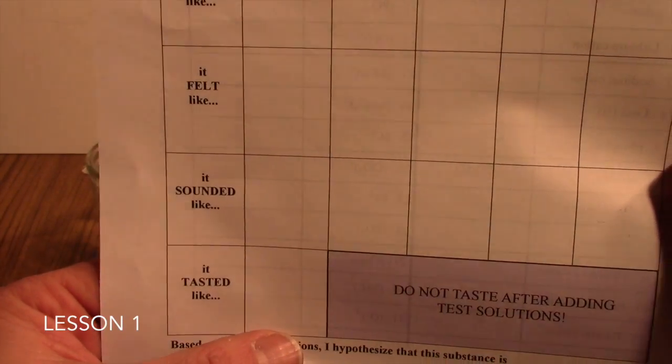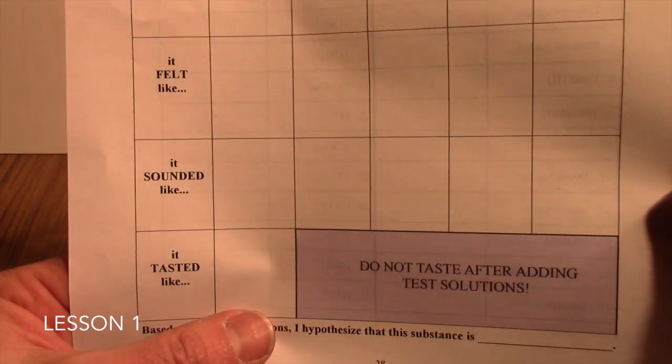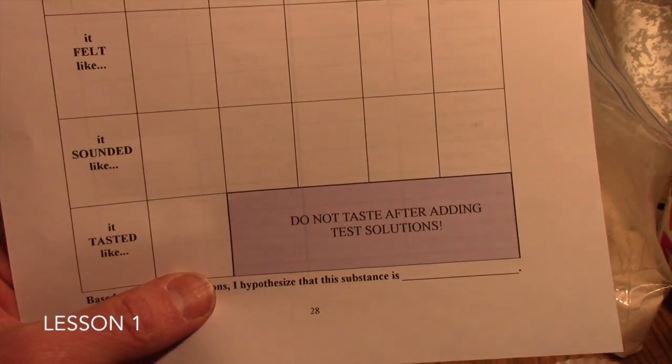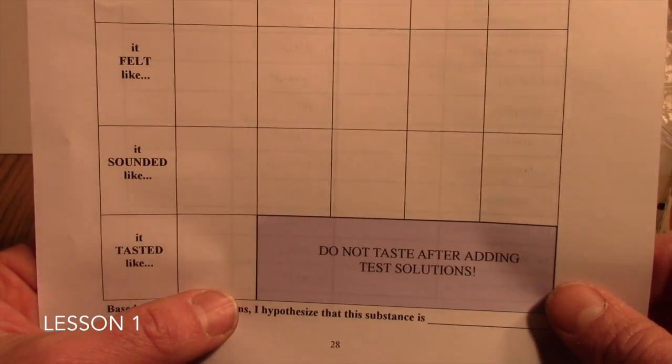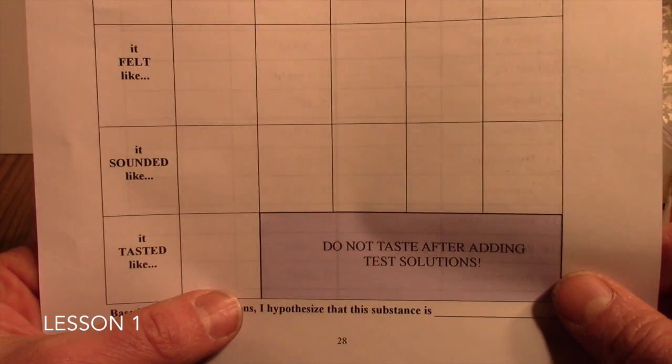And then it tastes like. And this is where the student will just lick their finger and touch the powder and put a little taste on their tongue to get a taste of it.